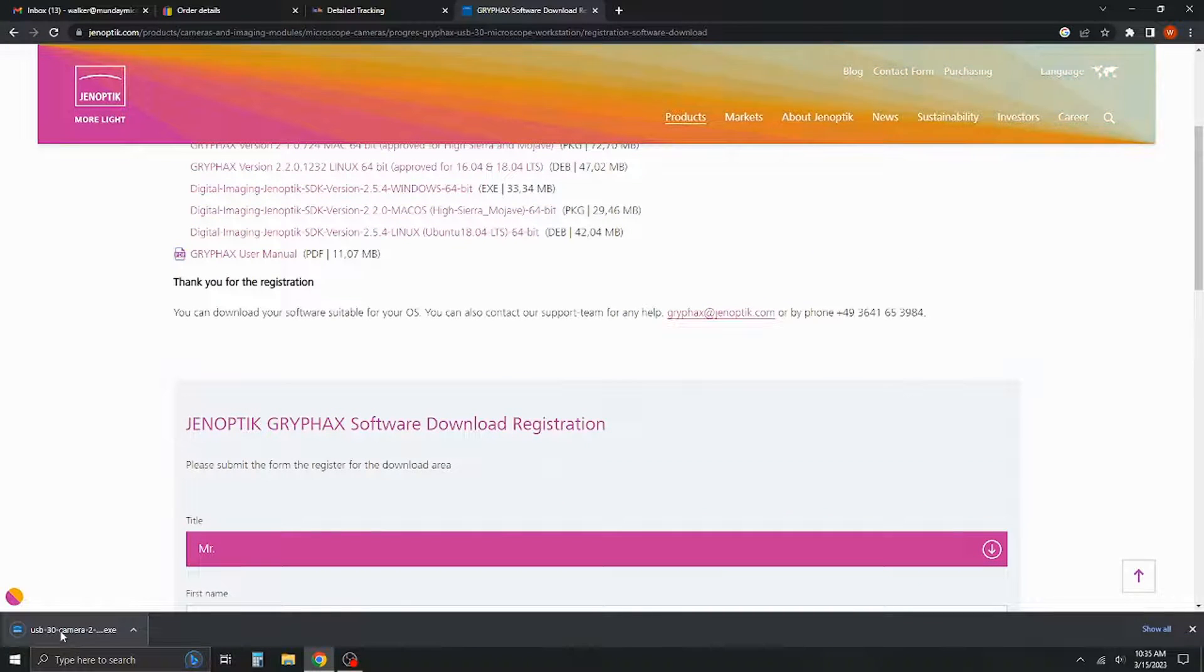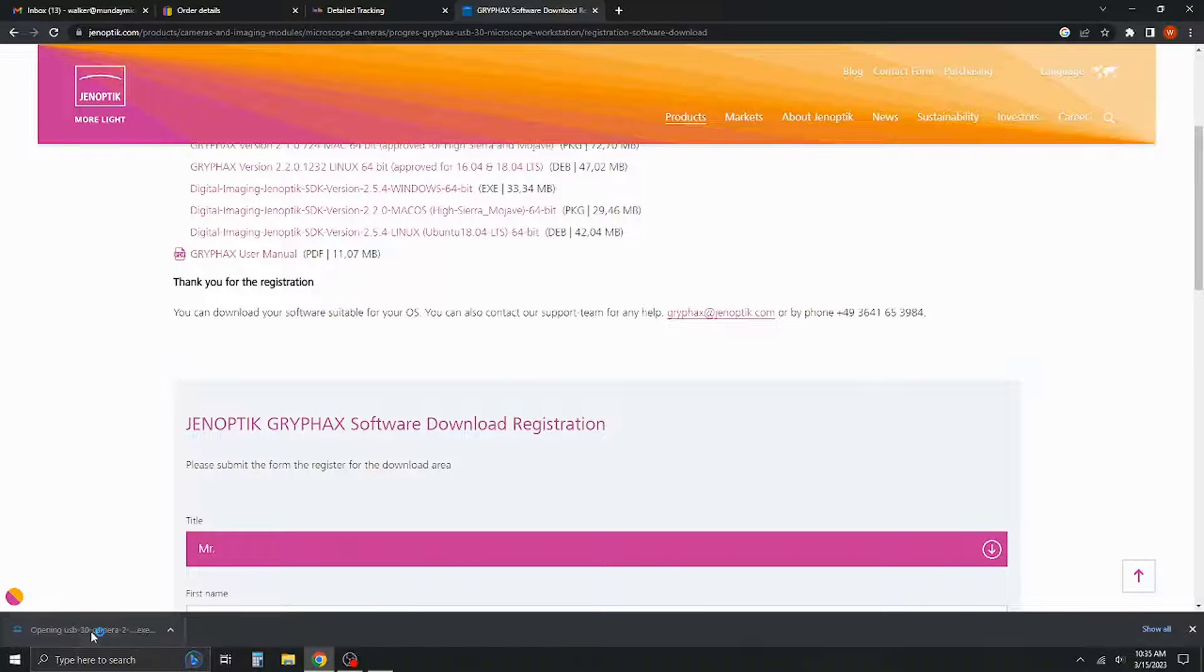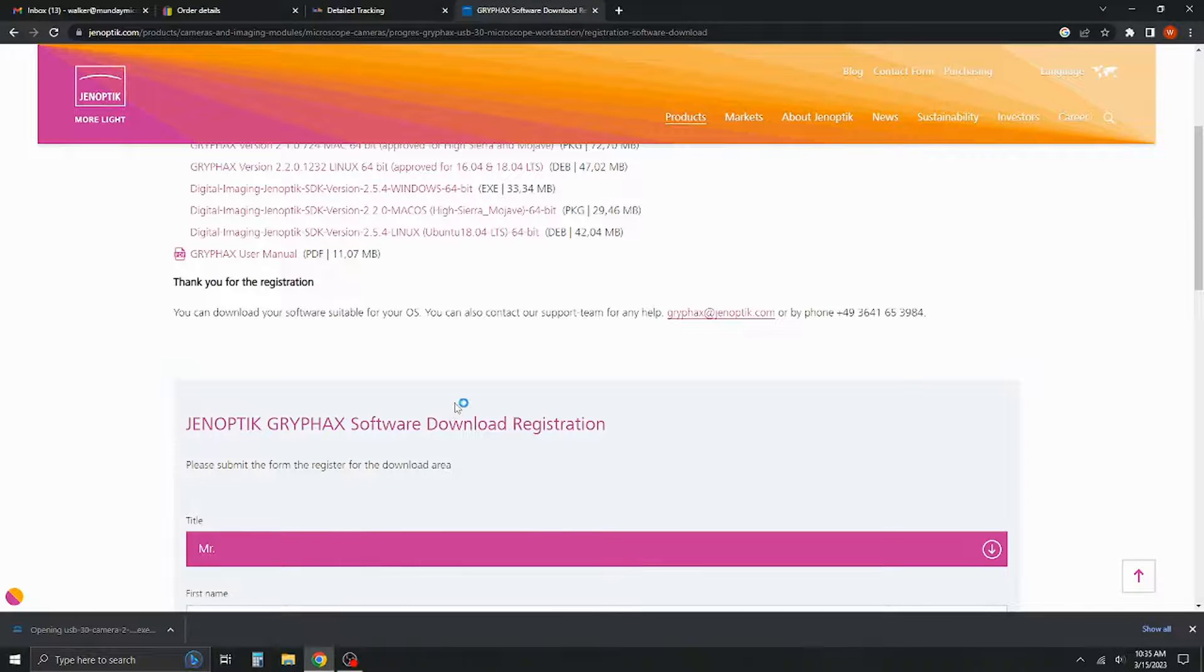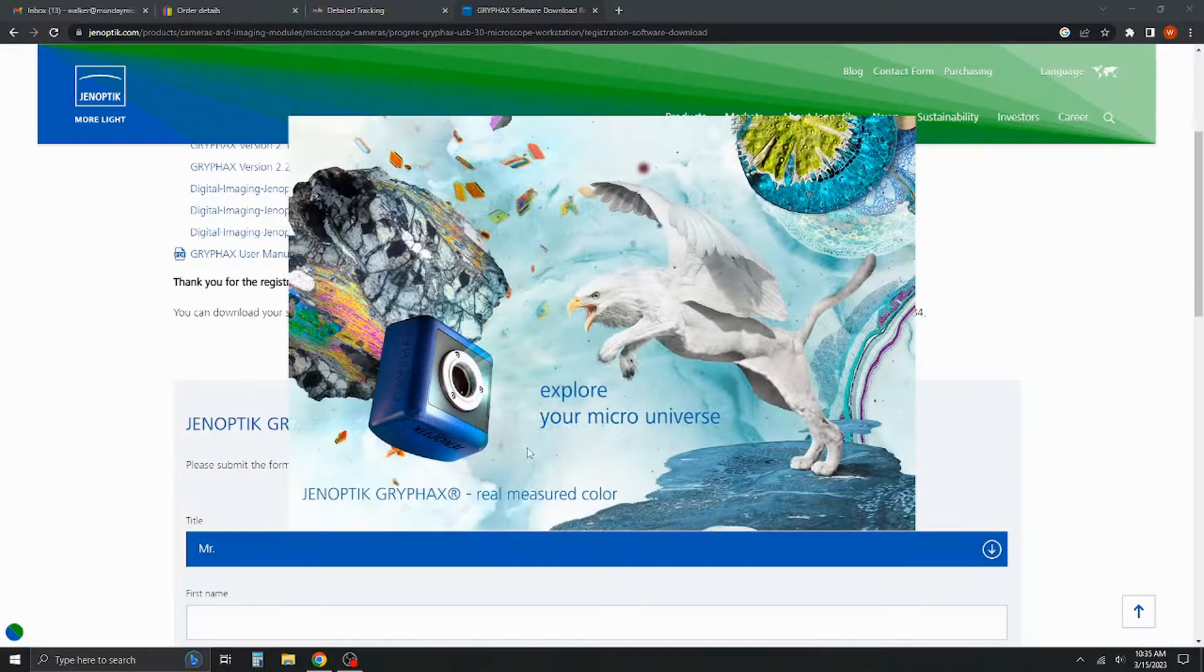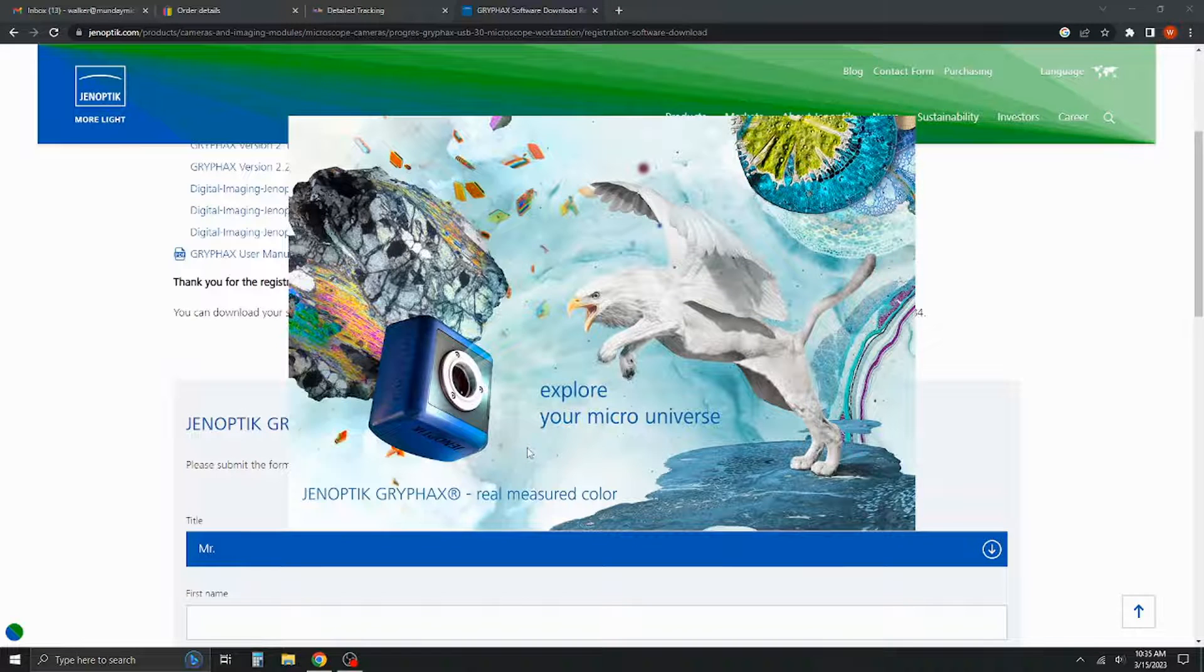Okay, so we have our main package downloaded, so we're going to go ahead and open that. Now, you're going to see the screen go black here real quick. All this is is a Windows security prompt. It's going to ask me if I want to download this to the hard drive on my computer. It may change the device. And we're going to click yes. And now you should be seeing my screen again.